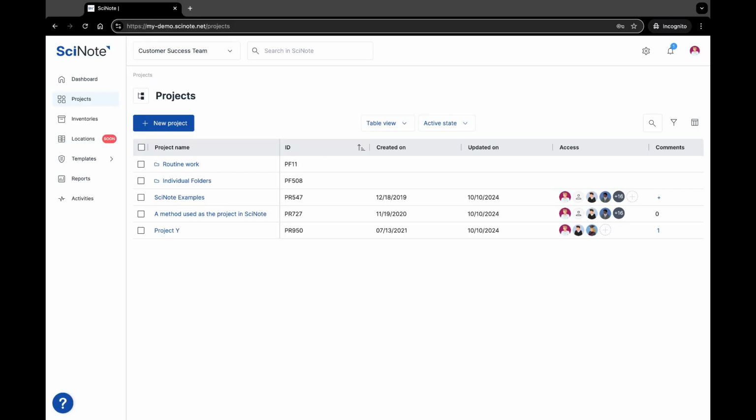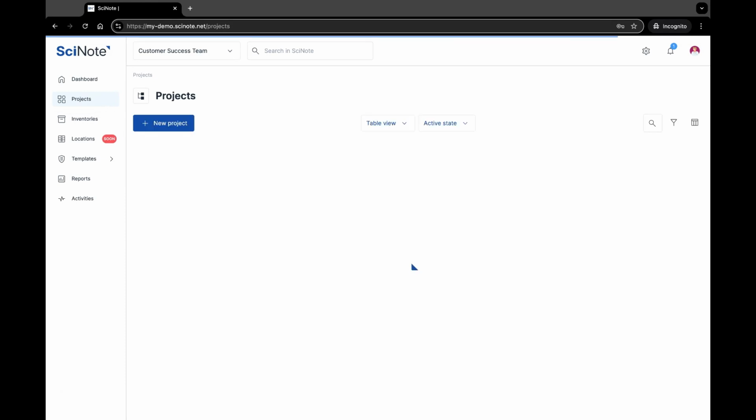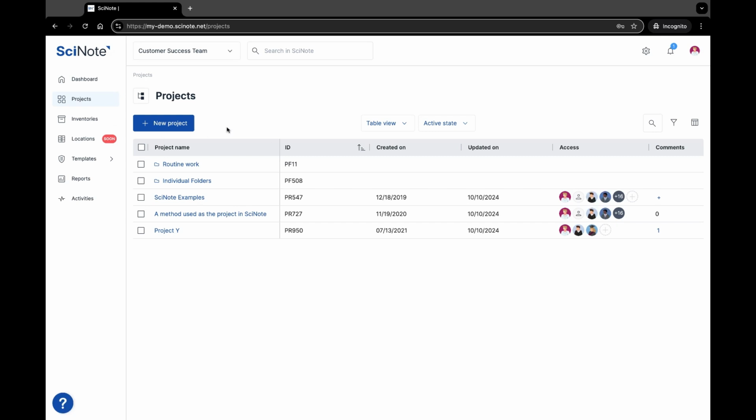In this video, we'll cover how to use your project dashboard for your team's project work within SciNote. From the left-hand panel from any SciNote page, you can access projects by clicking on Projects. These projects, as a reminder, are specific to the current team workspace you're in within SciNote.